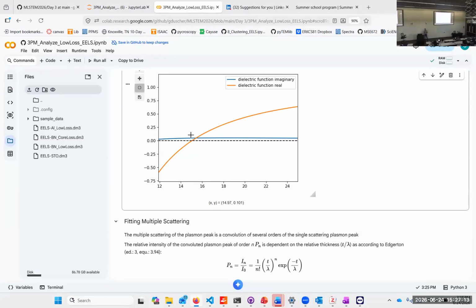So all the electrons in the valence region move out. They move away from it. And now what happens is when we take it away, it's fast, right? So the valence electrons relax back, and so it makes a kind of oscillatory behavior. So this is the same way as, let's see how good this one rings.